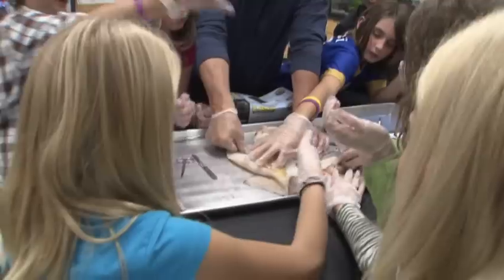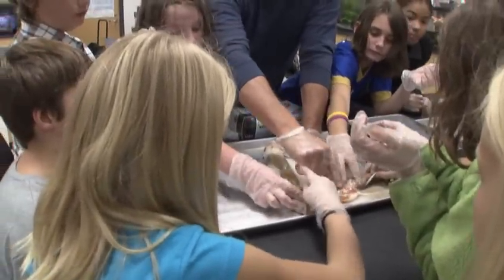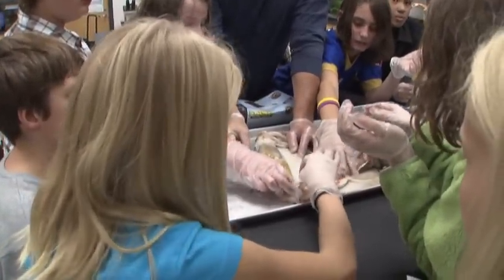So you guys are wrecking all the eggs. What's the red stuff? This is part of the cecum. This is where food is processed down here. Can we take some eggs out?